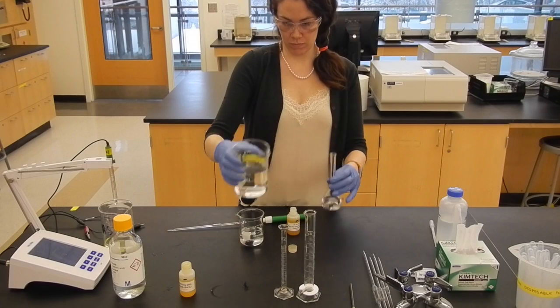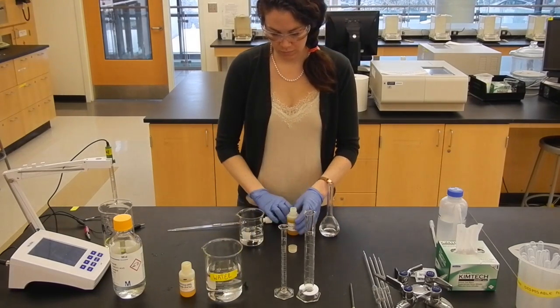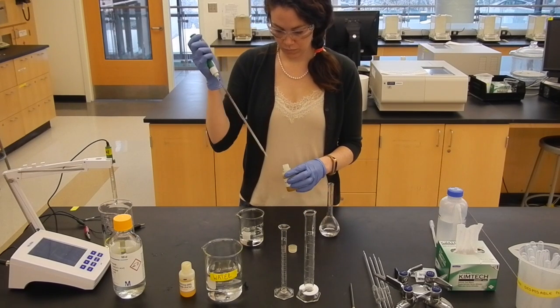Following the same procedure as before, carefully pipette 1 milliliter of iron ammonium sulfate into the volumetric flask.